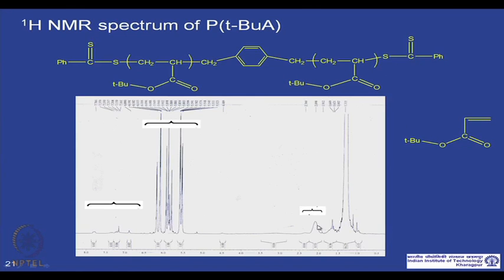This means that not only using proton NMR spectra can we get the molecular weight of the first polymer, but we can also monitor, since this is a spectrum from a crude sample, the amount of conversion of monomer into polymer with time. So, basically we can do a kinetic study of the polymerization process.